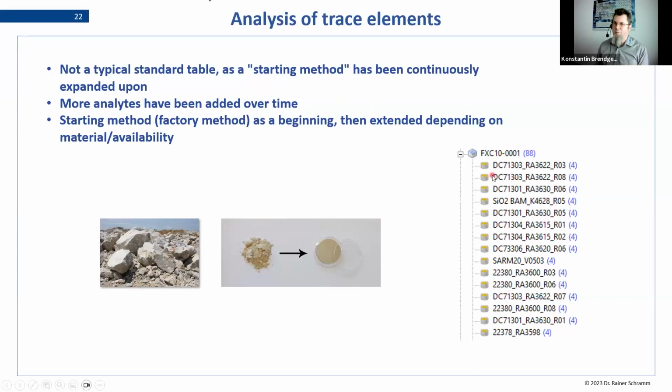Yeah, we have this baseline calibration, but depending on what future analytes or present analytes we want to do, we added a lot of standards. You can see here, this is from our spectrometer's method, actually. Some of you might recognize the names here. These are standard names that were added over time. And this is only a little clip of the 88 standards that we have added so far.